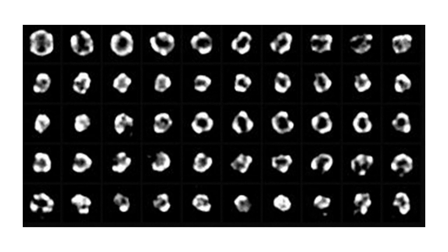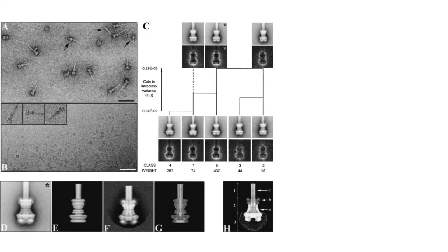In this manner, we get a series of unified images, each of them corresponding to a particular orientation of the specimen. Then all of these different images representing various orientations of the specimen are compiled with one another by using computer software. In turn, it produces a three-dimensional image.